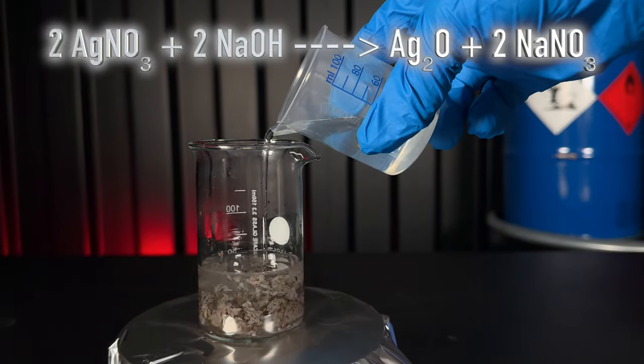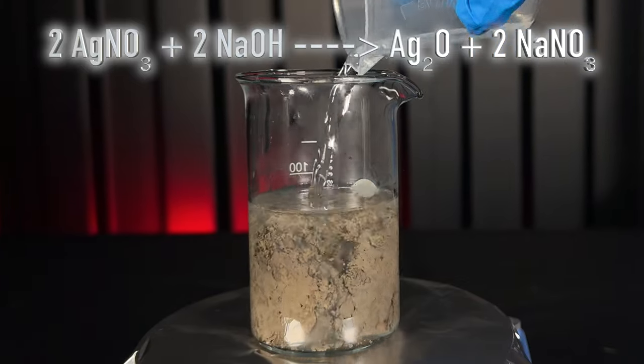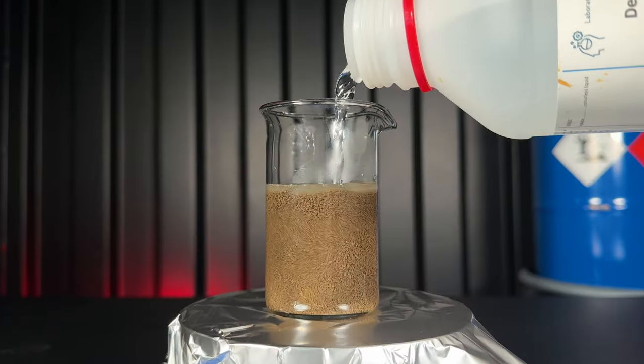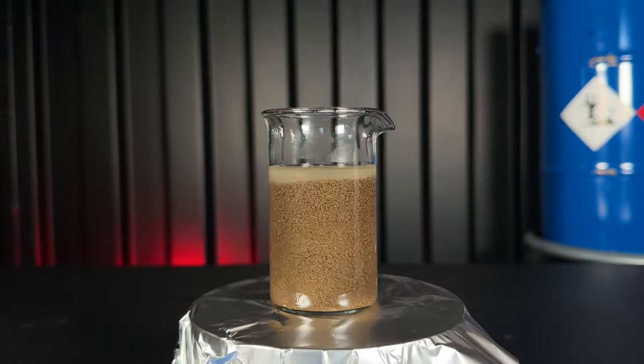When silver nitrate reacts with sodium hydroxide, it instantly forms this nasty looking brown silver oxide. I added more dihydrogen monoxide and stirred the reaction for 2 hours to ensure that all the silver nitrate gets destroyed.